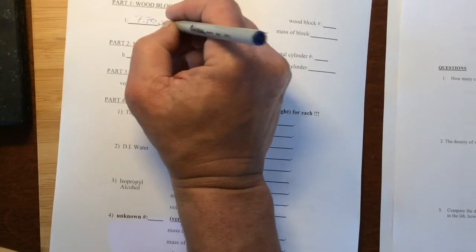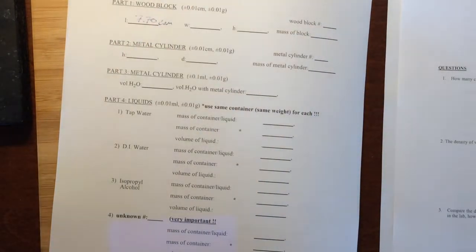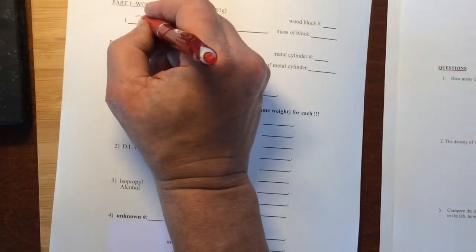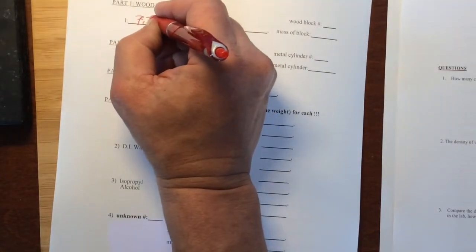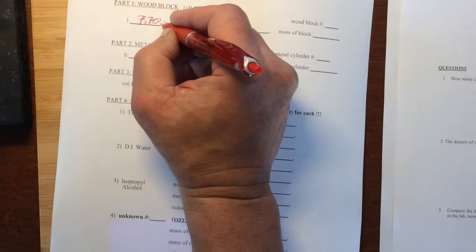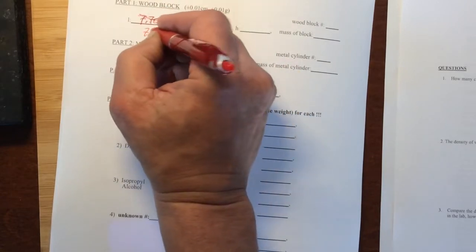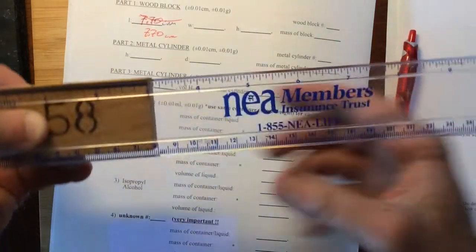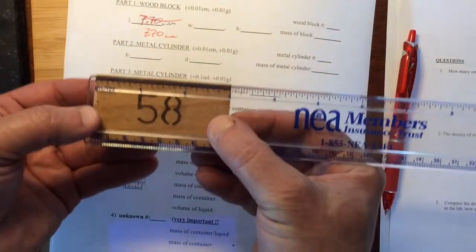We should include units. I need a better pen. I'll use my magic teacher pen. 7.70 centimeters. So that's what I will call the length.